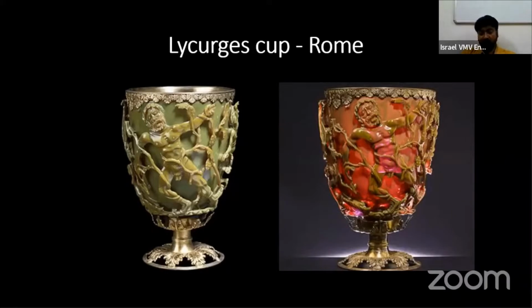The application was what was anticipated out of the cutting down of materials to the nano size. With the modern tools, when they were analyzed, it was found that they had size in the nanometer regime. The modern tools analyze them with a different focus. And when we talk about nanomaterials, we mean engineered nanomaterials. We cannot say a sub-micrometer particle is just a nanomaterial.